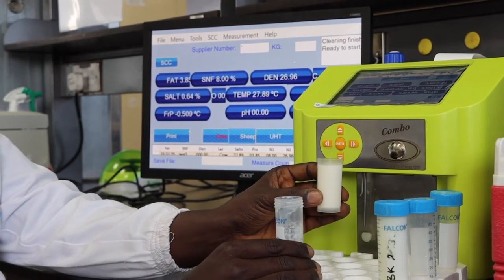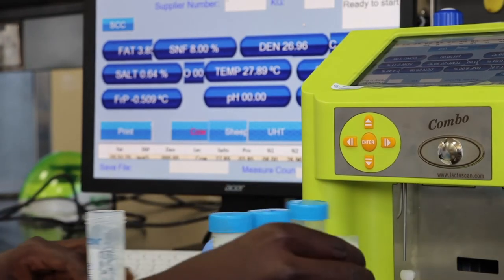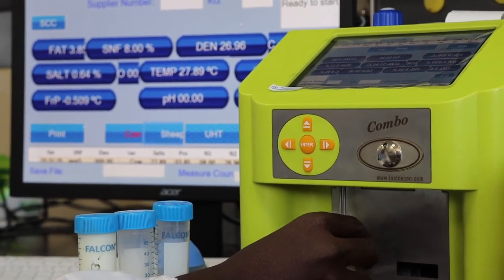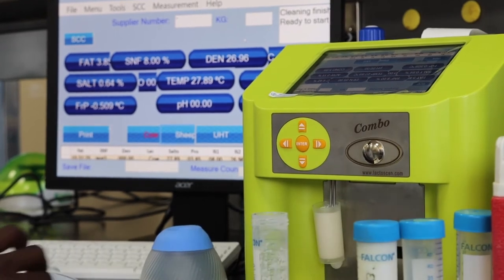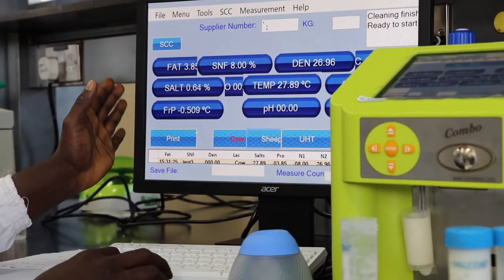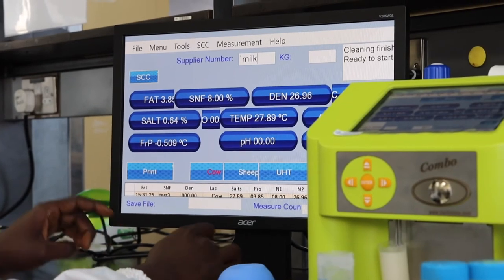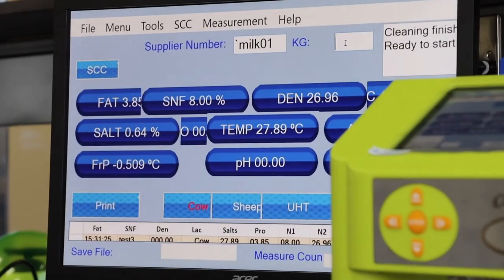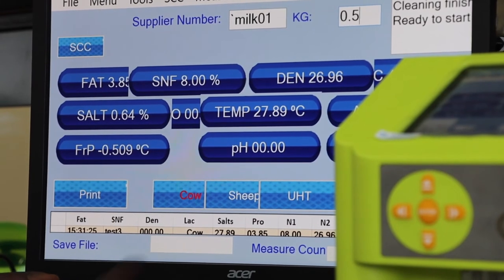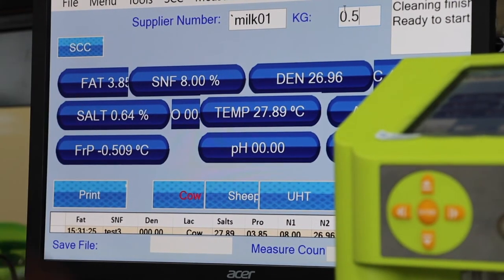This vial holds about 30 to 35 ml of the sample. Once the sample is transferred, you introduce it into the recess of the equipment. You then need to make sure the sample is correctly identified on the monitor window — you indicate the sample ID, in our case 'Milk 01', and a figure such as 0.5 to indicate the amount in kilograms. Note that this data is not used in computing the results you obtain.